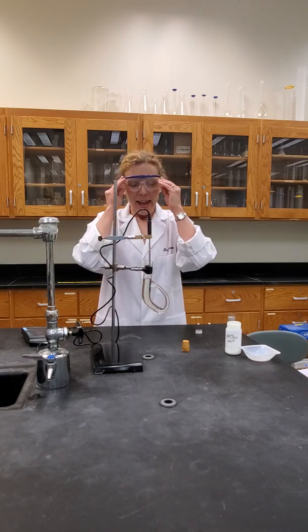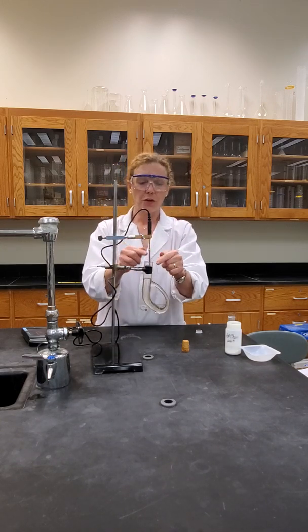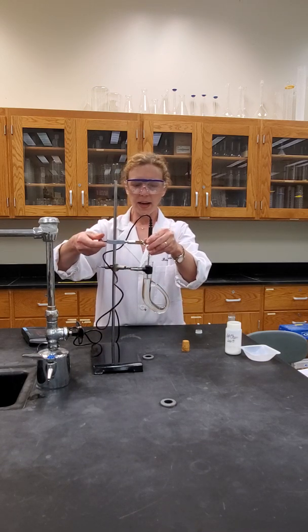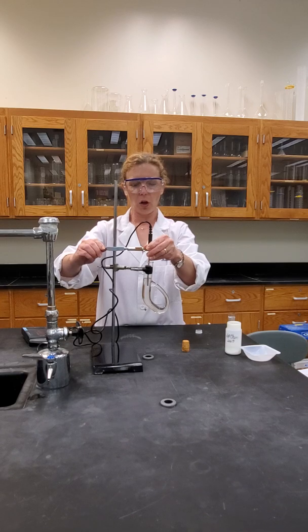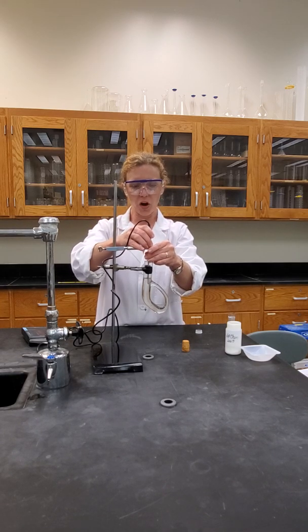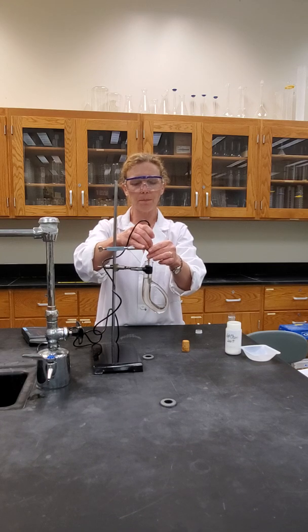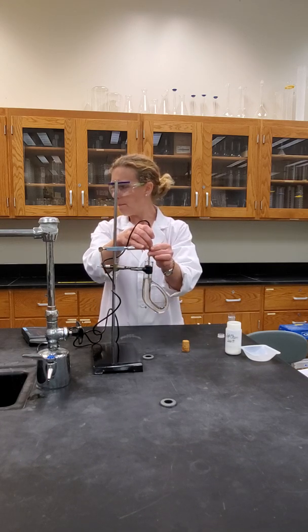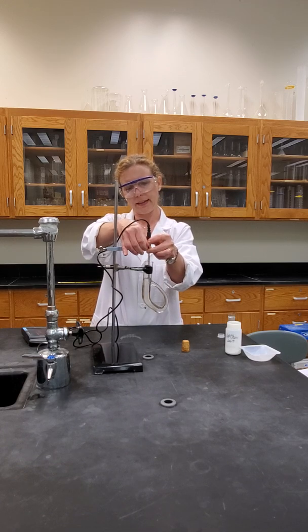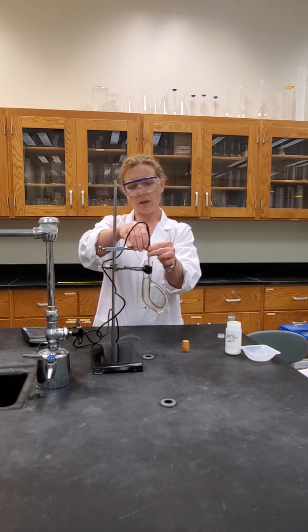All right. Now, as I said, you want to center your sample where this intersection is. So, before we start to change the temperature, I'm going to go ahead and lower that, and just make sure that it is not touching the walls of the Thiel tube. And so, it looks like maybe I need to adjust this. It's just being a little cranky.